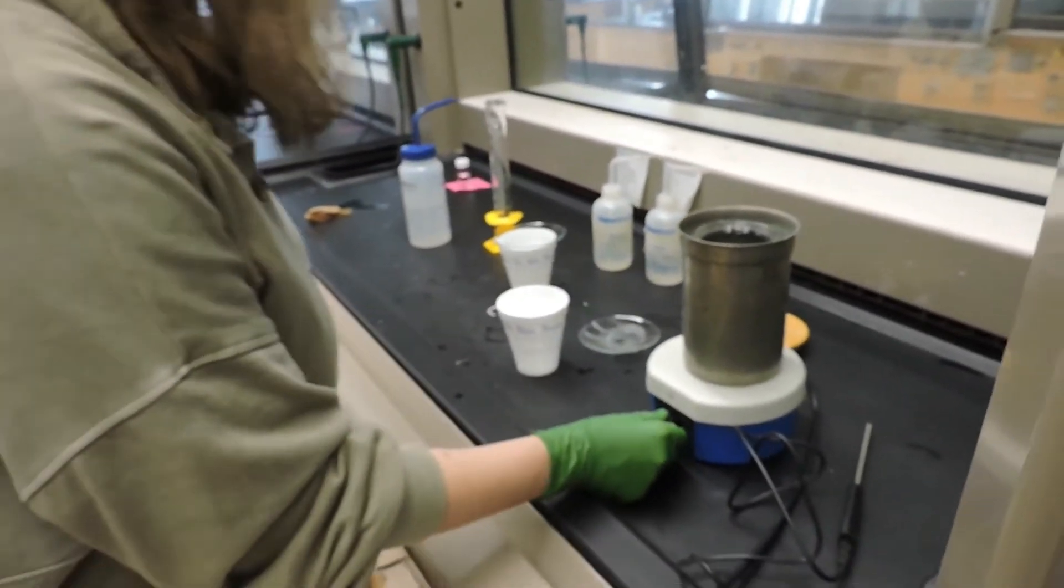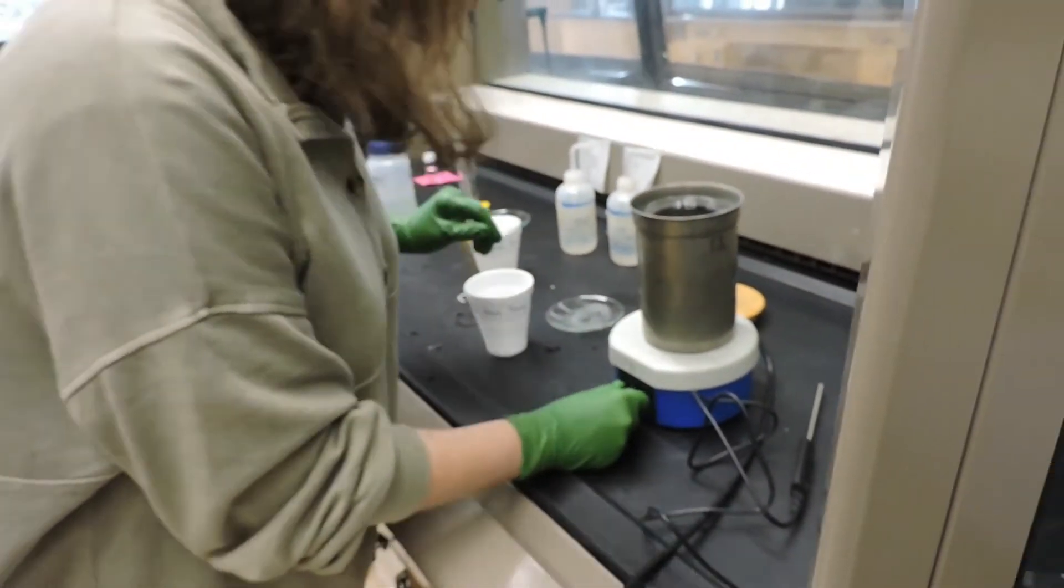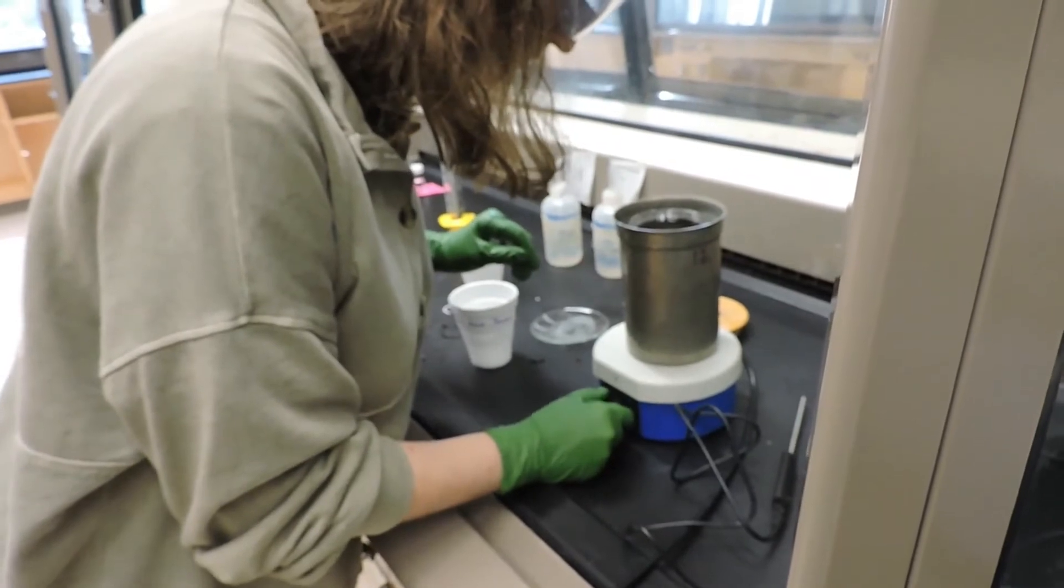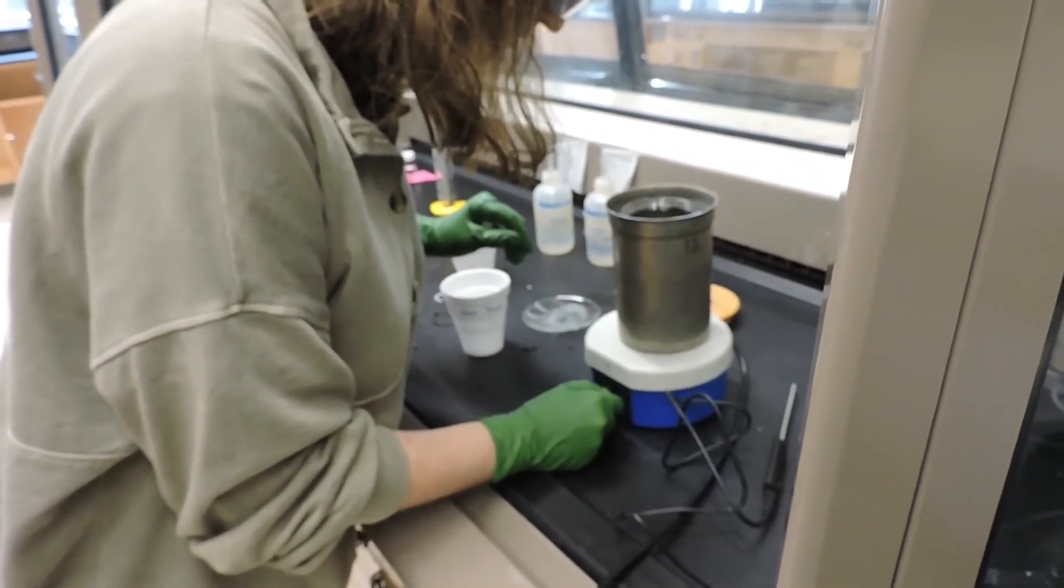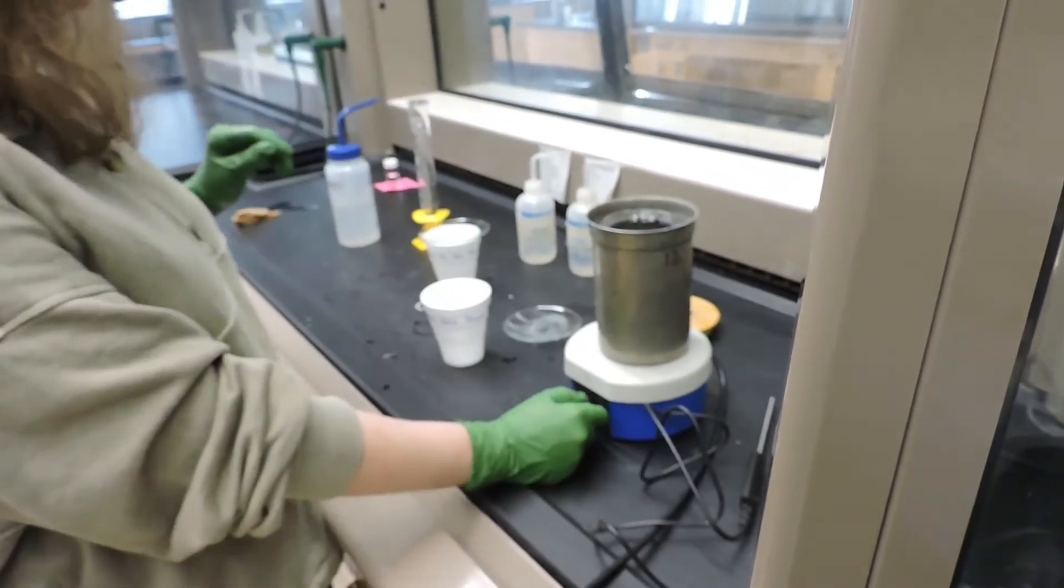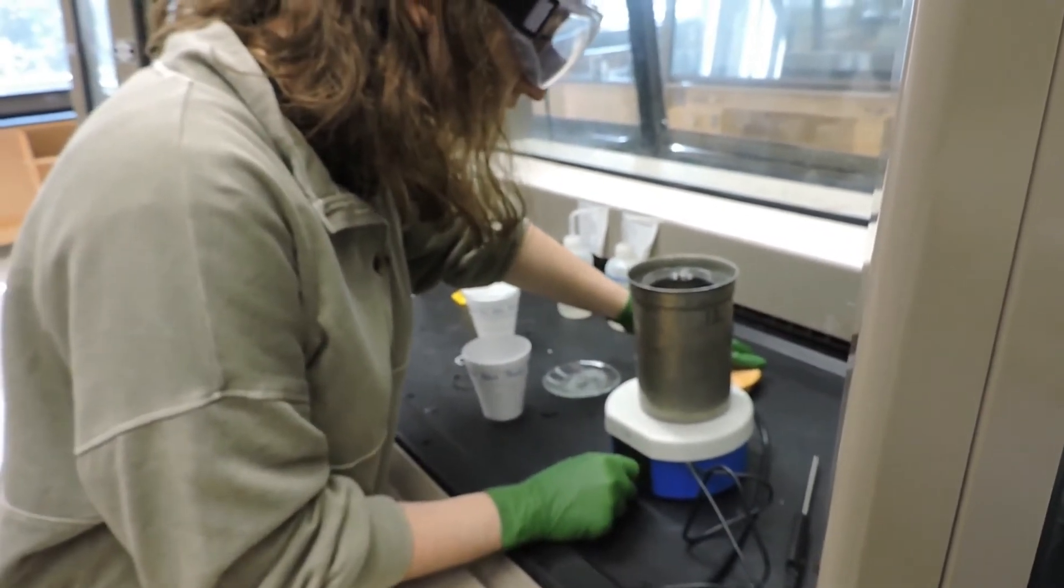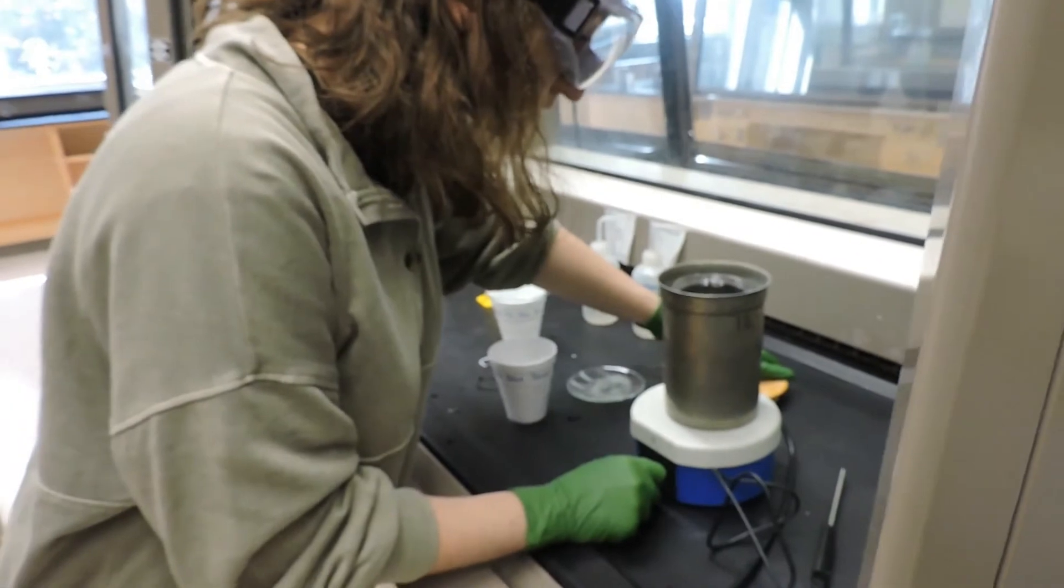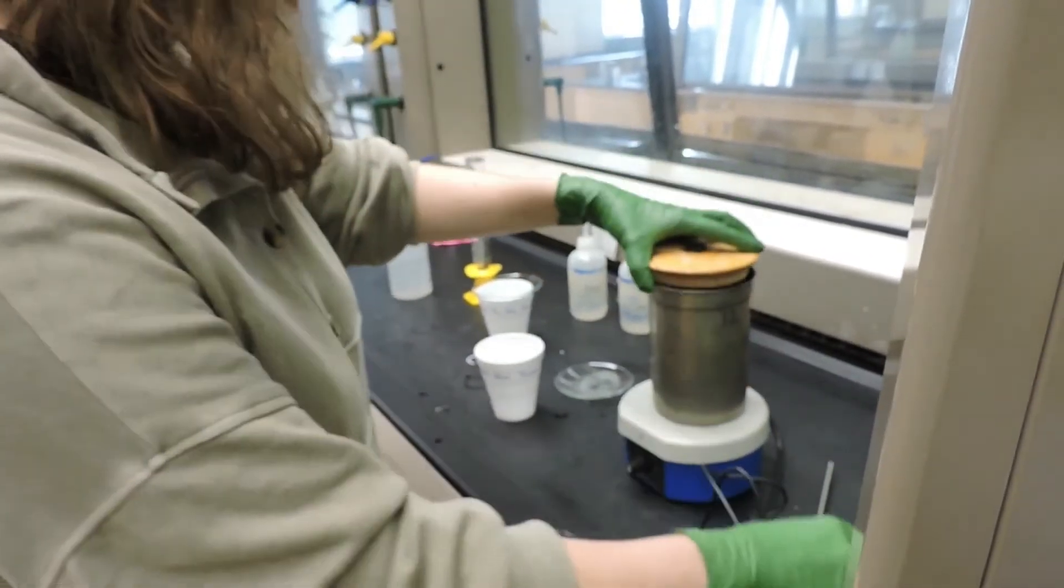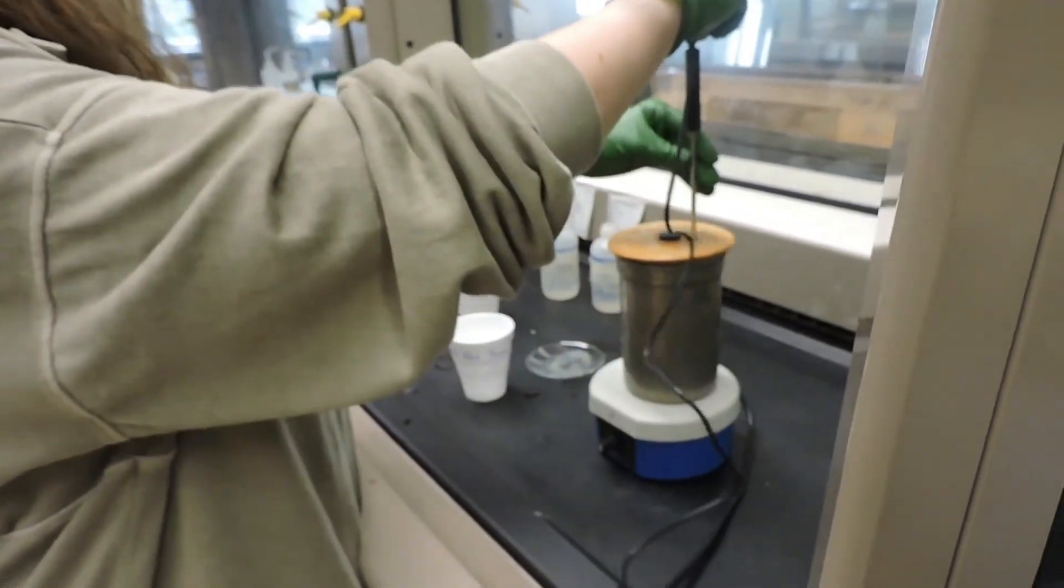Now that we have 150 milliliters of deionized water in the calorimeter, we are setting the magnetic stir to a gentle stir rate. We can assume the water and the glass parts are at the same temperature as the water for this system. So what we're going to do is cap the calorimeter, put in the probe, and wait for the temperature to stabilize.